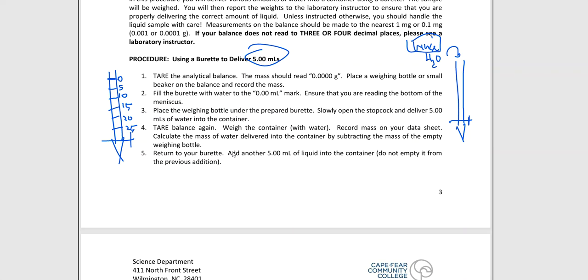I don't know what's been in there. I don't know if that thing's nasty. That person that could be using it was nasty. Maybe they didn't clean it out. Who knows? Maybe they ate french fries and they got grease and nasty stuff and sludge all over it. I mean, that's something that I just don't know, and I don't trust anybody. And I think the moral of the story, you cannot trust anybody in the lab. And that probably includes me.